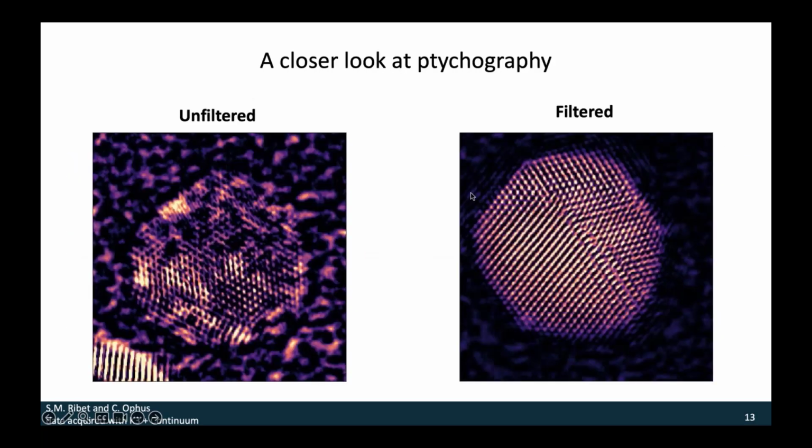So I'll blow this up so you can see this even more clearly. Both of these have similar resolutions in our reconstruction, similar features that you can see, but because we're doing this energy filtering, it's going to help us converge our lower spatial frequencies and get this even nicer reconstruction.